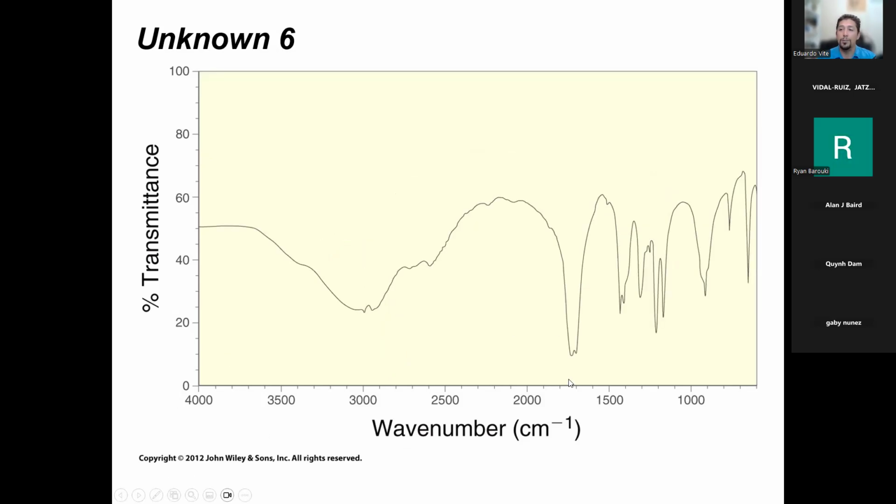Sometimes you're gonna see spectra that look terrible. Like whoever did this hasn't cleaned their instrument, hasn't calibrated it in a while. This is like when sometimes we have a TLC and the spots are a little bit too large. But remember, we can still get information out of it. So even though this spectra might not be the best looking spectra because the baseline starts at like 60%, my goodness, they gotta clean their instrument. This is still enough information. So what do we see here?